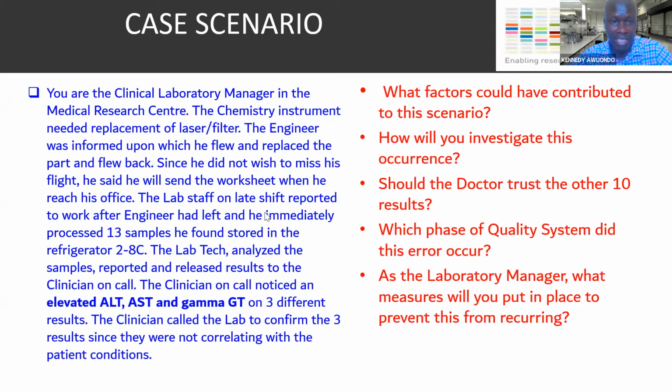Yes, so I'll proceed. Since the engineer did not wish to miss his flight, he said he will send the worksheet from his office. The lab staff on the late shift reported to work after the engineer had left and found samples stored in the refrigerator, between 2 to 8 degrees centigrade. They analyzed the samples, reported and released results to the clinician on call.